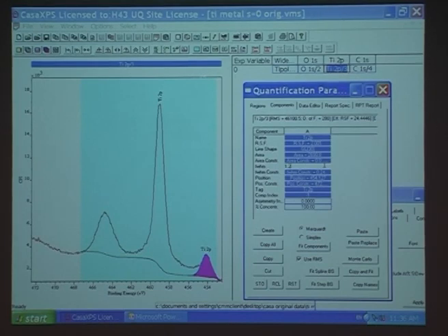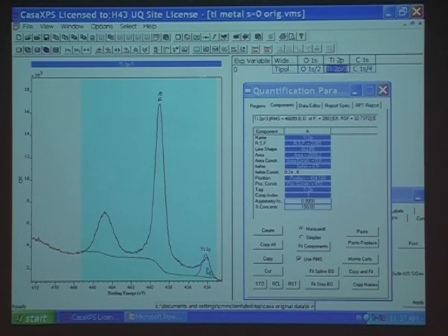So I'm going in for the titanium metal and make it about 0.9 and see what sort of a fit I get there on the side. It's not too bad. I bring it in. I've made a little note here to what I've used. No, I haven't. Well, that's all right. I'll give it now not much restriction, so I'm coming in here. Position. A full width half maximum constraint, which is here. I'm going to let it go from 0.8, comma, to say 1. 1.1 I might make it. Enter.